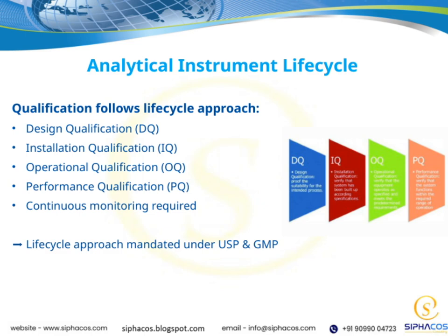Next is installation qualification, or IQ, which confirms that the instrument has been installed correctly and is ready for use. Then we move to operational qualification, or OQ, where we test that the instrument operates according to specifications under normal conditions. Following that is performance qualification, or PQ, which demonstrates that the instrument performs reliably during actual production or testing scenarios.